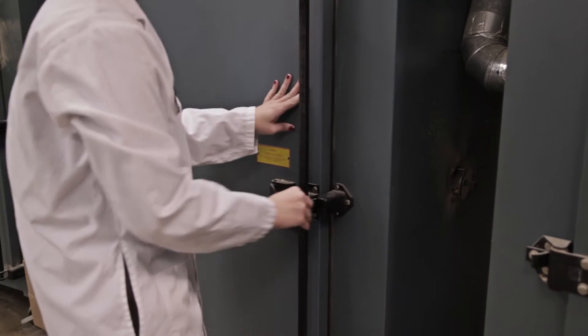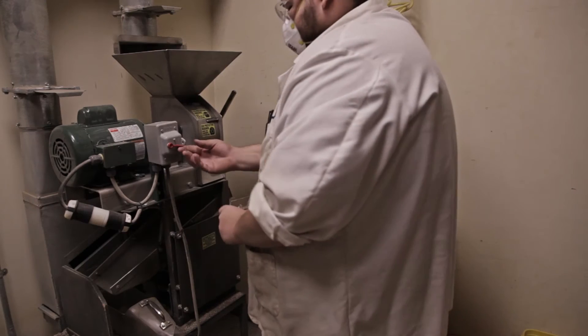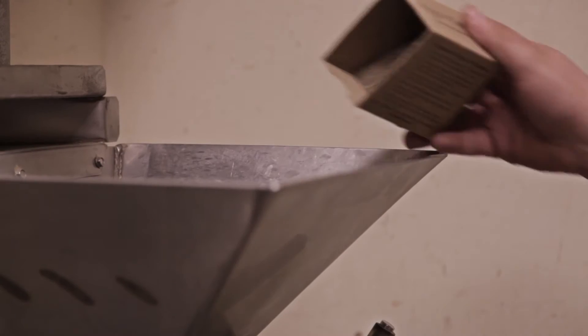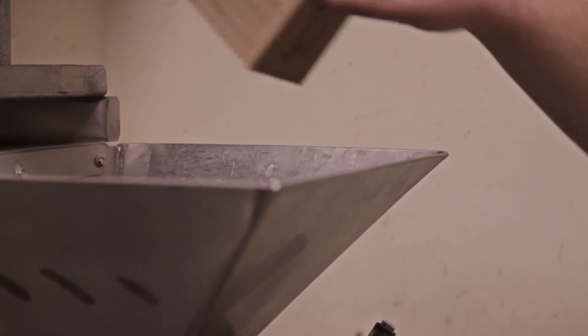Once they're all dry, they come out and we grind them in our grinding room. The sample is pulverized in a hopper and grinder. It falls down onto a two millimeter sieve. Anything that doesn't fall through the sieve is discarded, so you have a nice even distribution of soil particles.